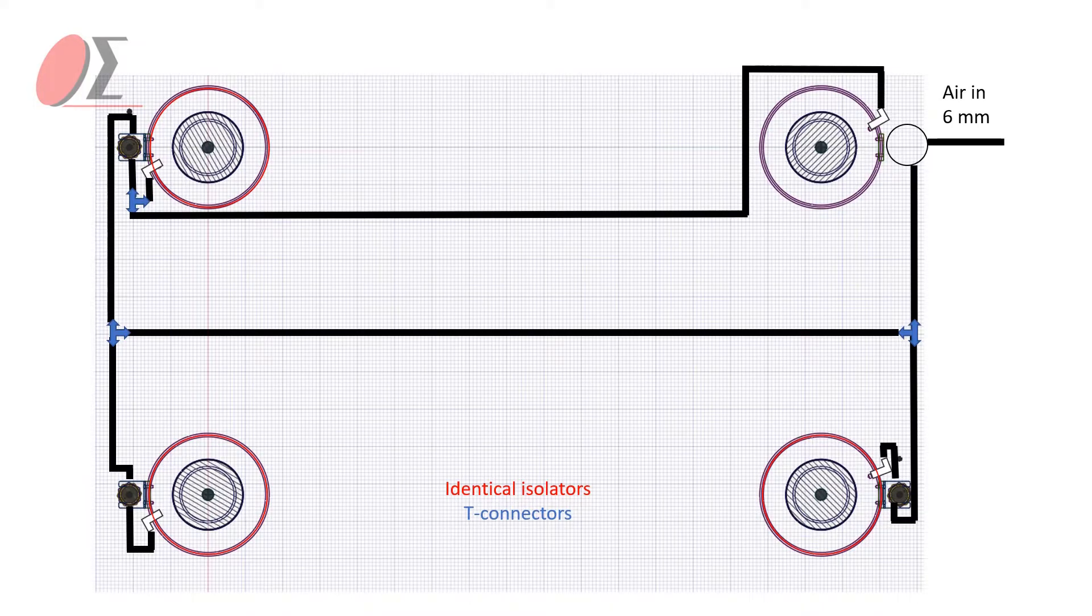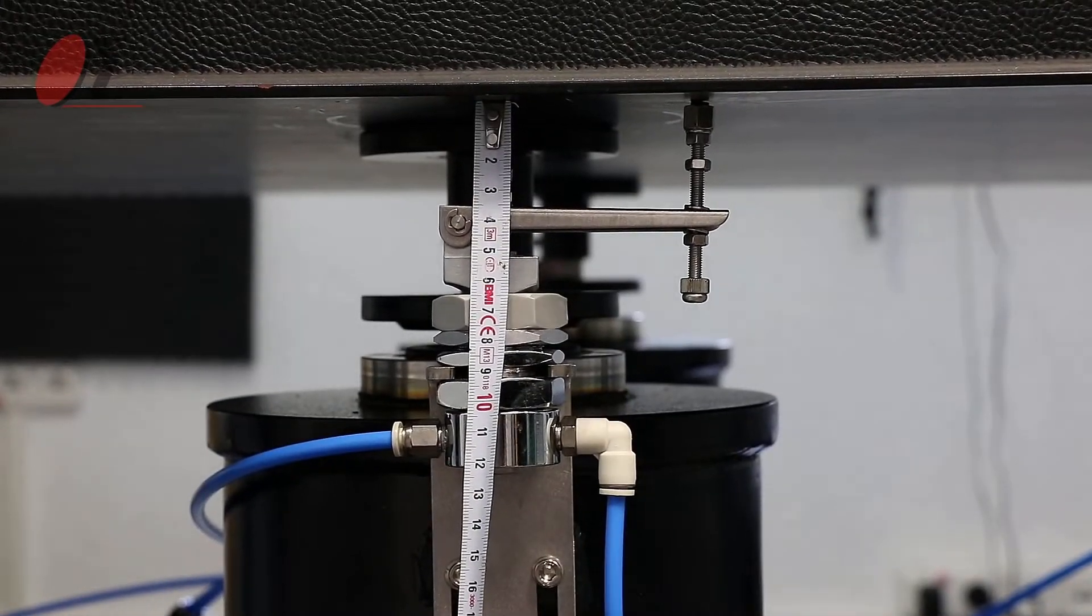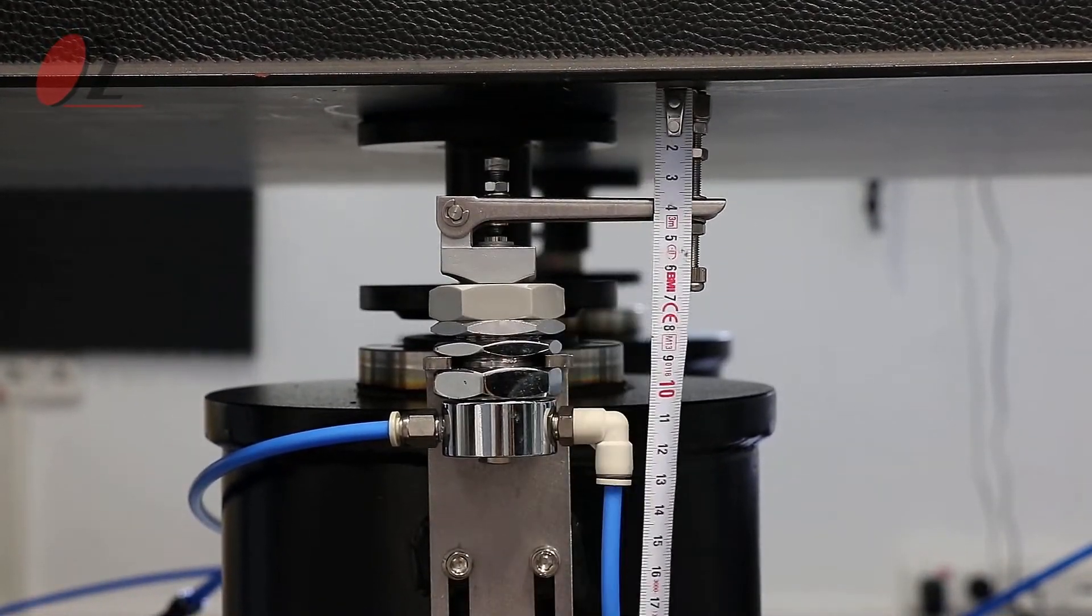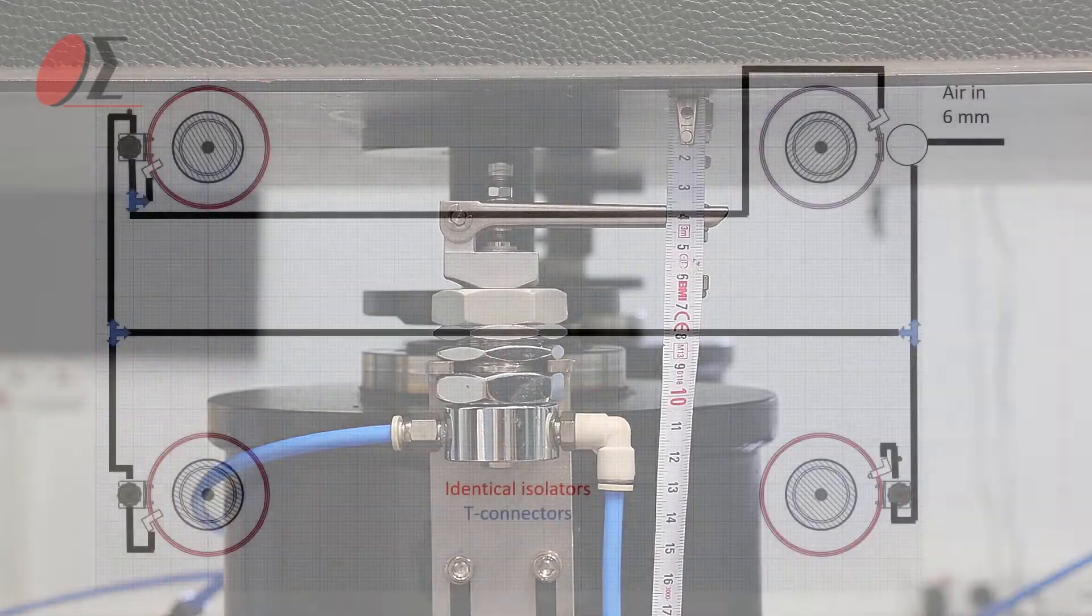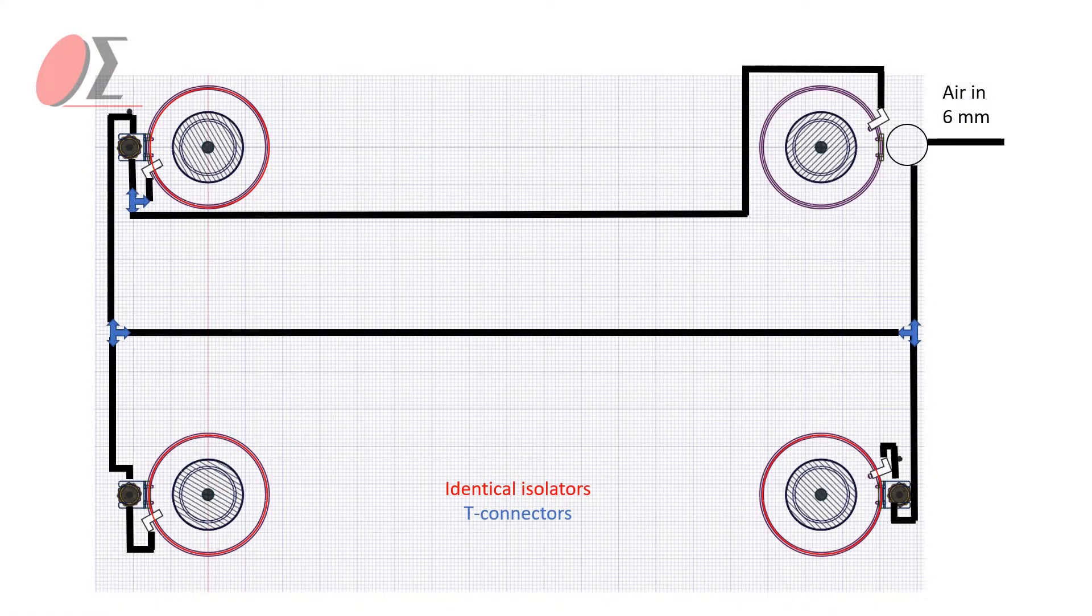After the successful manual leveling of the table, we recommend that you pay good attention to the horizontal alignment of the lever arm. This is crucial for the proper workflow later on.